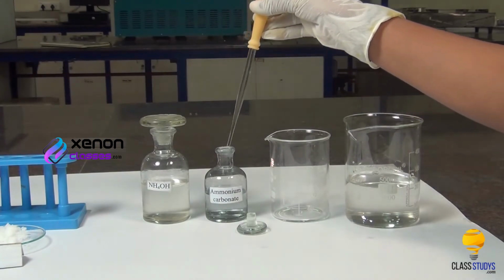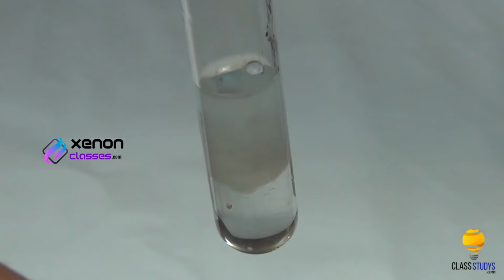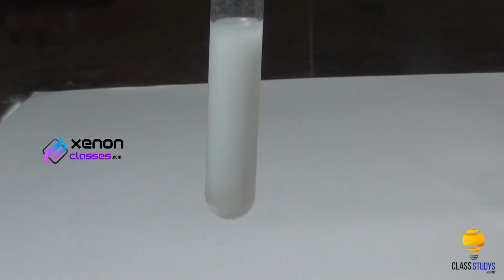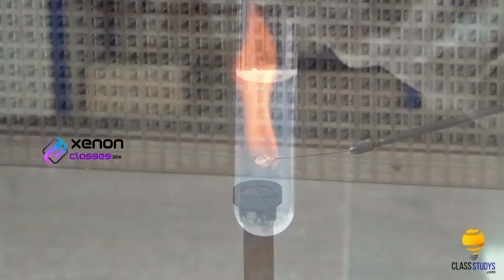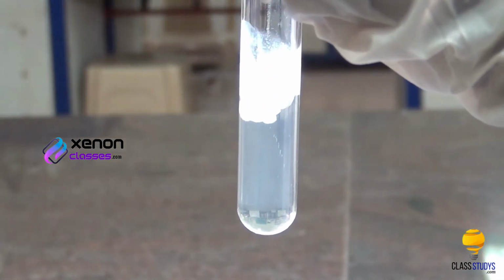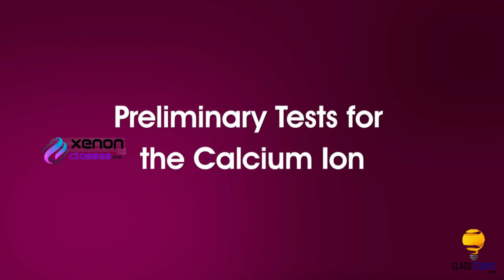In group 5, calcium ions are precipitated as their carbonates by adding ammonium carbonate to their solutions. Our aim here is to test for the presence of the calcium ion in a given salt. First, we look at the preliminary tests for the calcium ion.